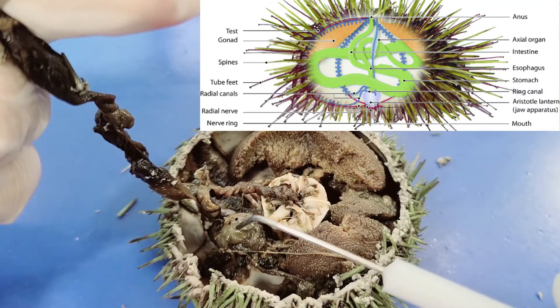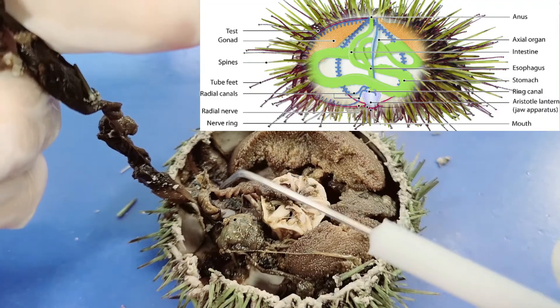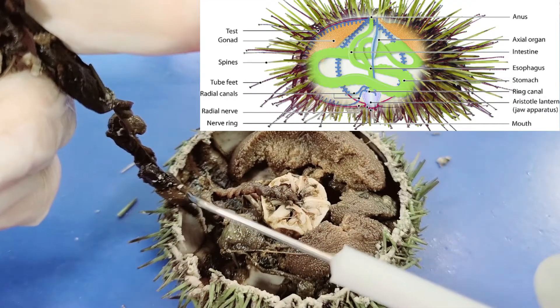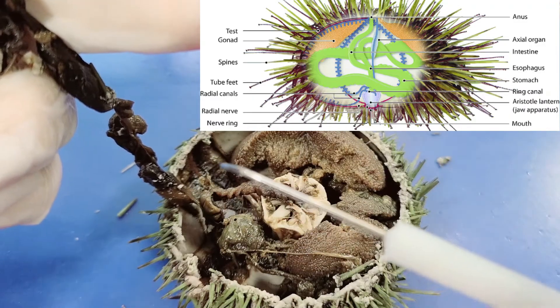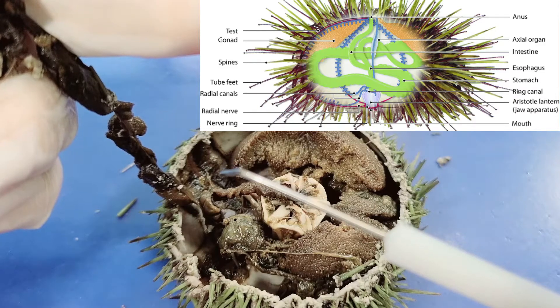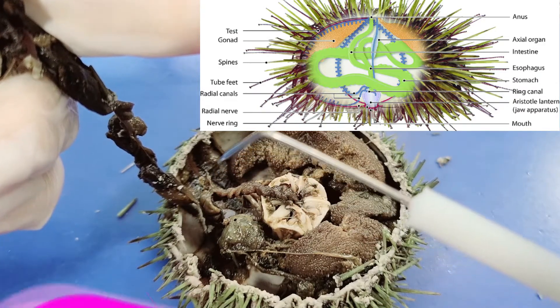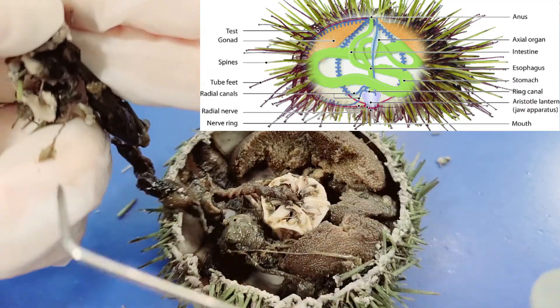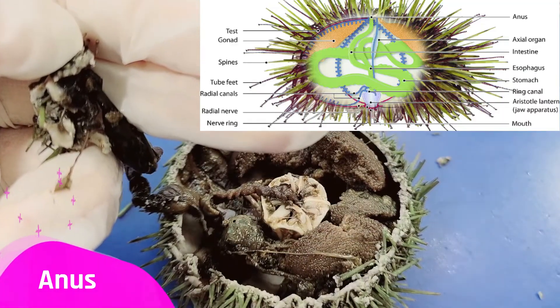The stomach runs in a full circle around the lower inside of the test, then leads into the intestine, which completes another circle in the opposite direction, higher on the test. Both the stomach and the intestine are normally attached to the walls of the test by mesenteries. After the intestine completes its circle, it leads into the rectum and then the anus.